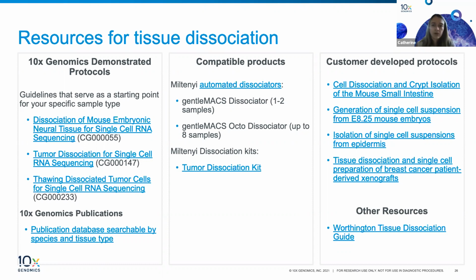We also have a section on the 10x Genomics website where you can find customer developed protocols. These are not generated or ultimately supported by 10x Genomics, but they're a great resource, and we know that many people are using these protocols successfully for their 10x Genomics assays. So that's a great place to review what's there as well.